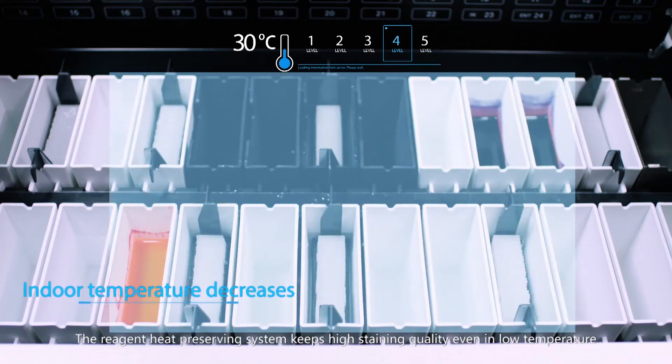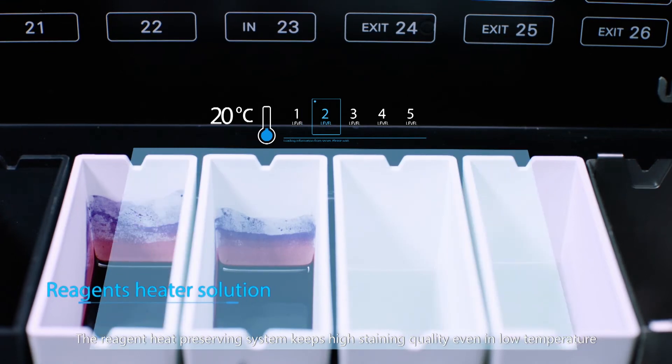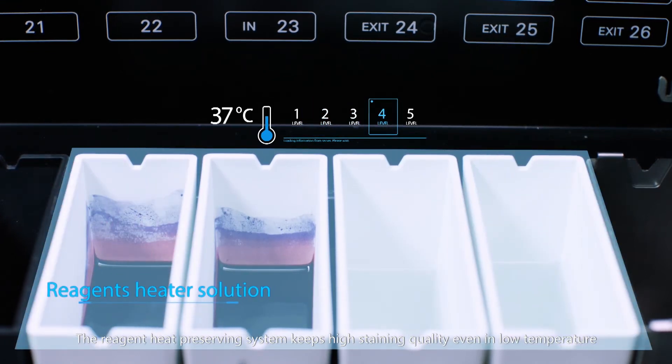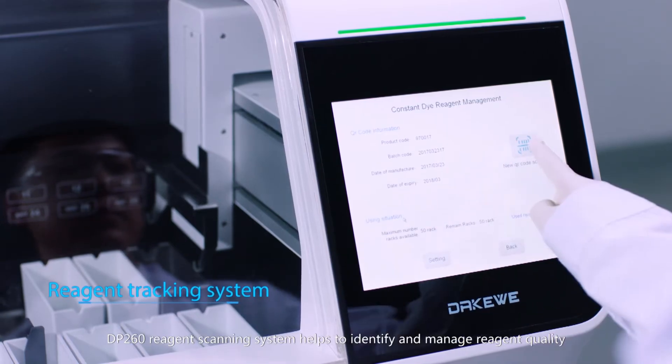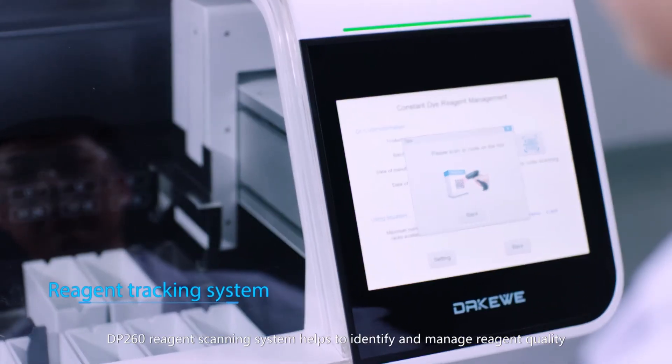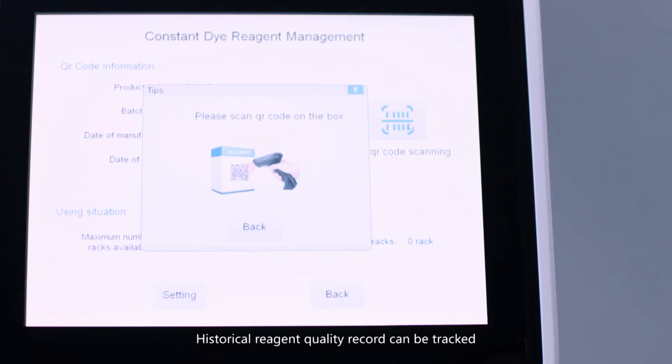The reagent heat preserving system keeps high staining quality even in low temperature. DP-260 reagent scanning system helps to identify and manage reagent quality. Historical reagent quality record can be tracked.